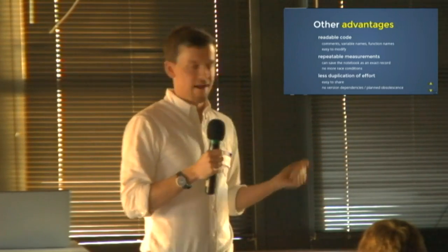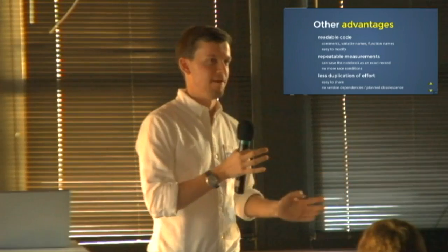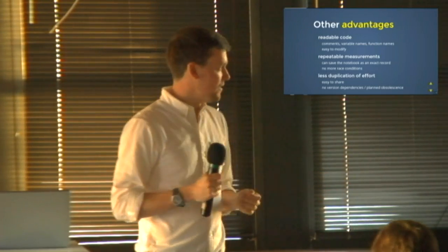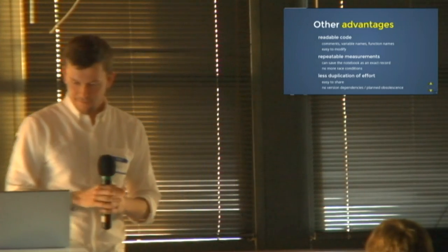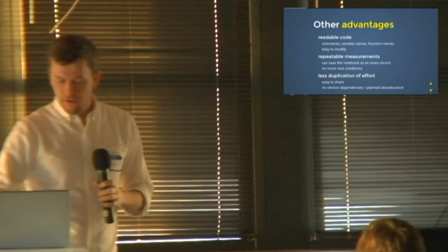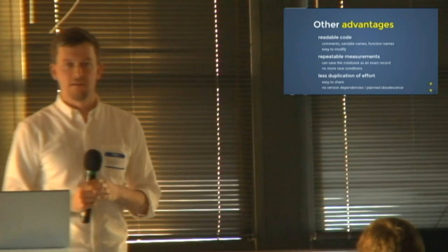And also, LabVIEW comes out with a new version every 2 or 3 years, which usually breaks backwards compatibility. So literally, it's better in just about every possible way. That's about all I have to say about how our lab has been using these for data collection.